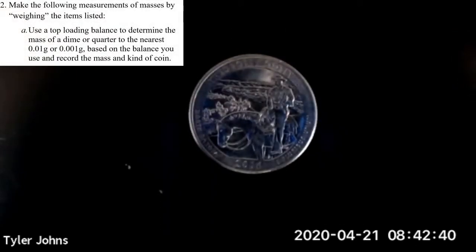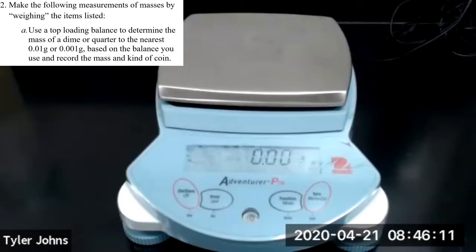Okay, so this is the quarter that we're going to be using for part 2 of this experiment. We'll be determining its mass. This quarter is a 2016 quarter. We're first going to use a top-loading balance to determine the mass of our quarter. So this is a top-loading balance.